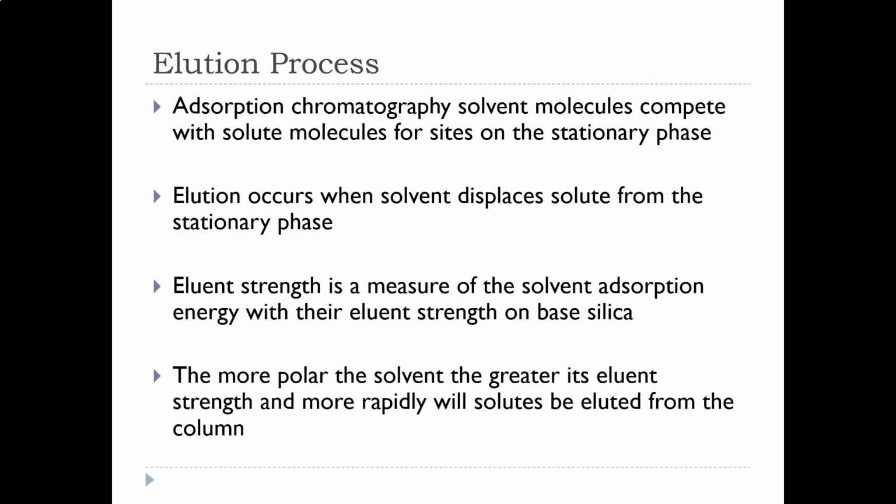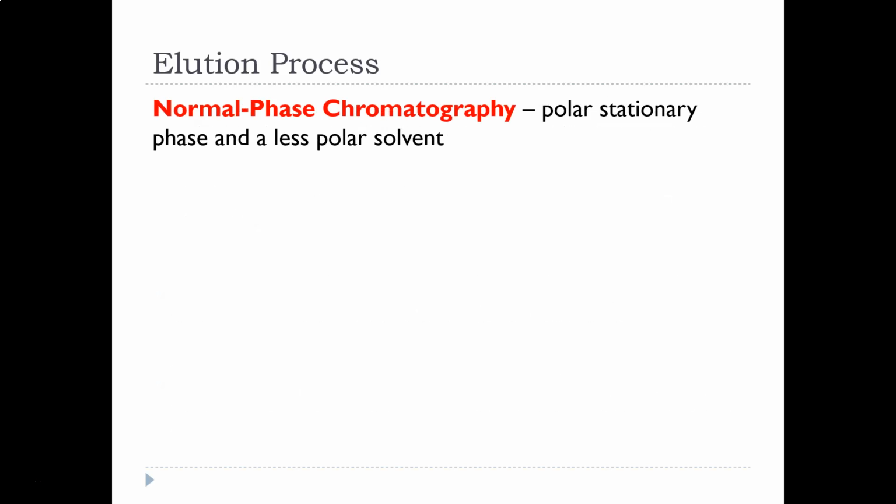So when we're looking at HPLC, and I'm gonna give you some definitions here in just a second, it's all gonna be about polarity because it's adsorption. So we're gonna have the stationary phase and the mobile phase. One of them will be more polar than the other, but usually both of them are at least partially polar. We're not gonna have one that is completely nonpolar, and so that elution is all based on those intermolecular forces.